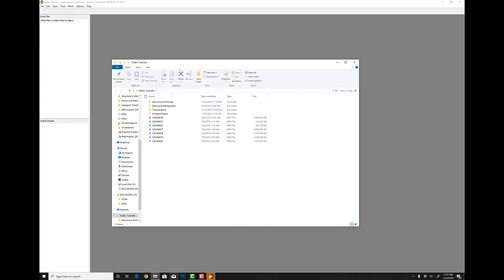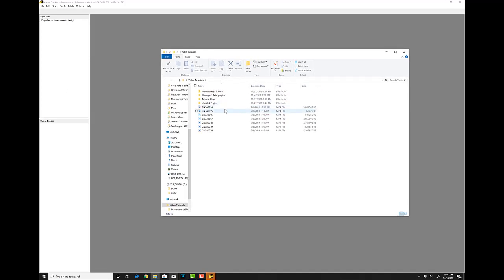For most geological specimens, 100x is way too much magnification. It's not usually necessary. By that point, you're resolving basically smaller details than crystals grow. So it's usually a pretty unnecessary objective, so we didn't do that. But what I'll now do is show you how to move through and batch process all of the finished data.